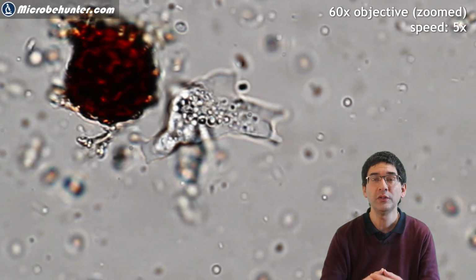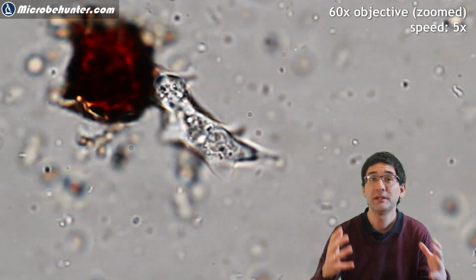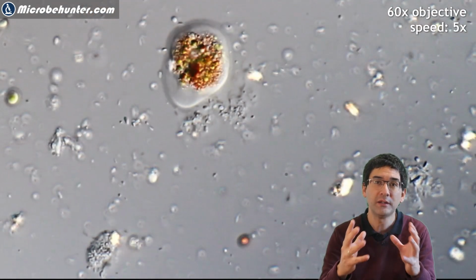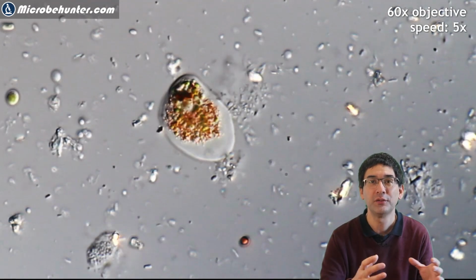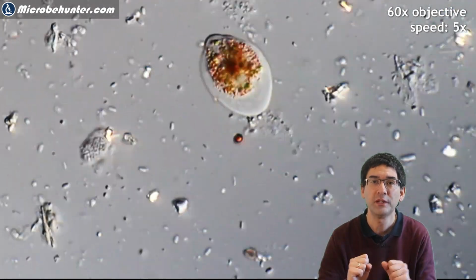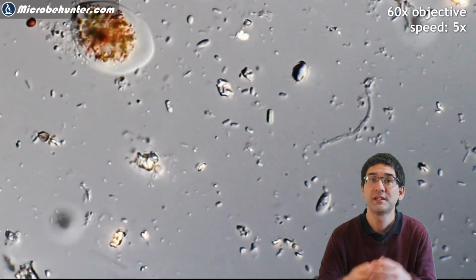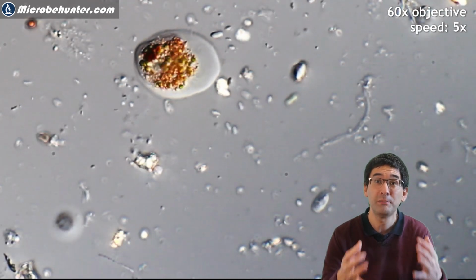And if you look around, then you're going to see that different amoeba actually behave differently. Yes, some are a little bit larger than others, but it's also their behavior that is changing. So this one, for example, extends all of its pseudopods around. This one likes to stay together more in a, I don't know, something that reminds me of a fried egg and moves around like that, and does not extend its arms out as much, the so-called pseudopodia. Yet others have again a different shape. Most of them are transparent. This one over here has evidently eaten something, so you see that there are some pigments. The cell organelles are pigmented.